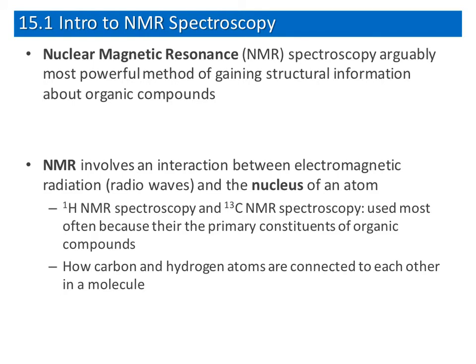So to identify the exact structure of a compound, there are a lot of NMRs that we can use. We can do hydrogen NMR, carbon NMR, fluorine NMR, phosphorus NMR, but in this course, we are going to focus on hydrogen and carbon because they are the atoms that can be found in almost every organic molecule, and we get the most useful information from them.